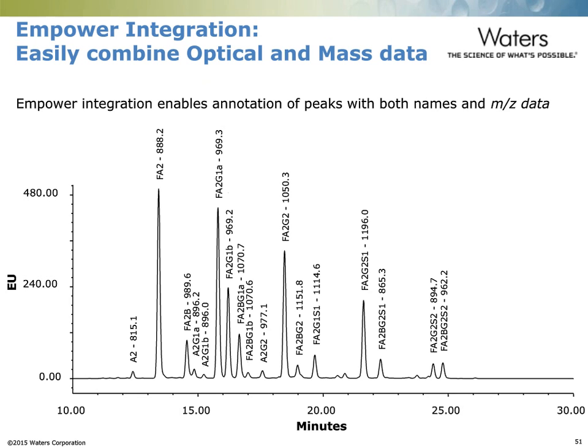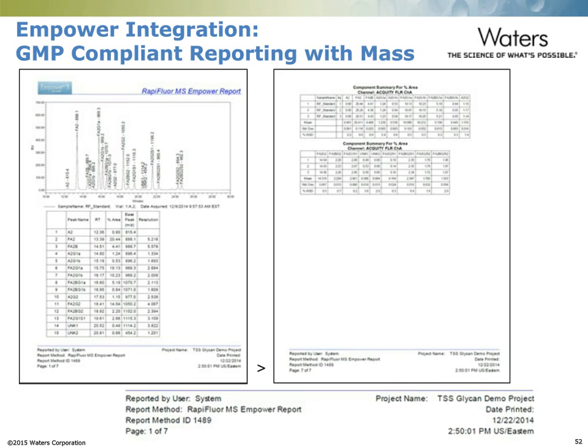And shown here is an example of a report. While it's admittedly somewhat difficult to read, we have an example of the chromatogram as well as a tabulated list of all structures within that separation. And shown on the right-hand page would be a comparison of different analytical runs, or could be different batches. And we can look very easily at the structures across different separations and see if there are any structures that are maybe increasing or decreasing in intensity.